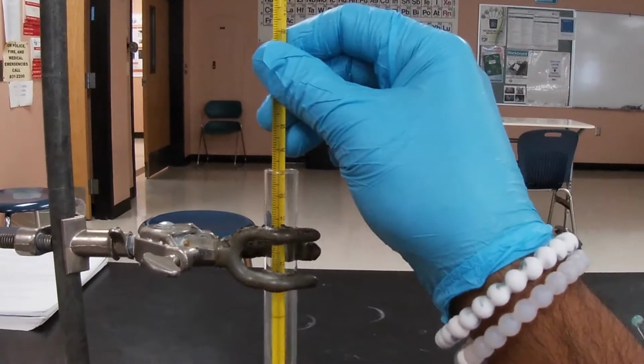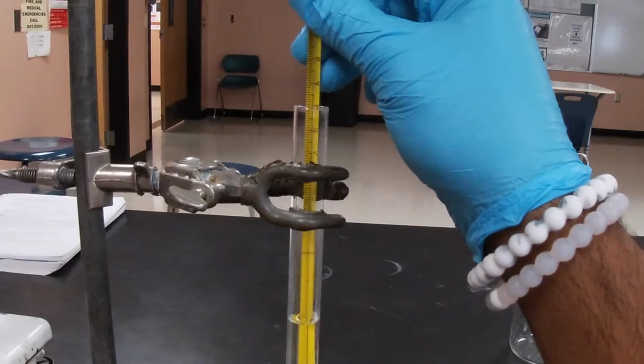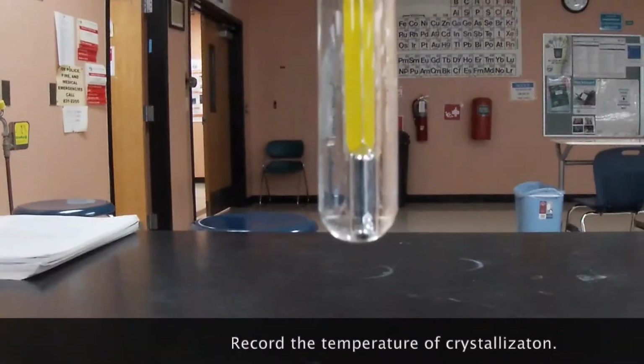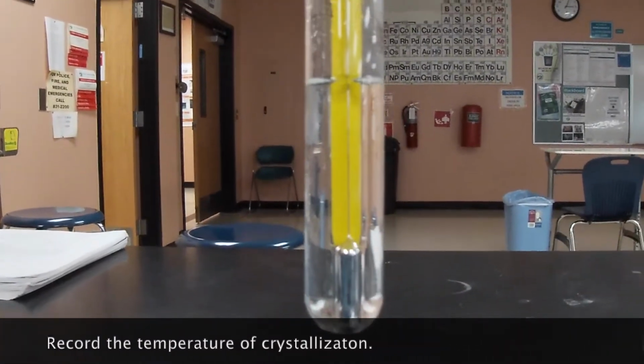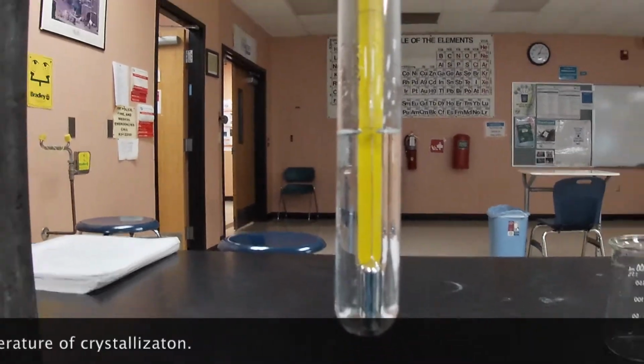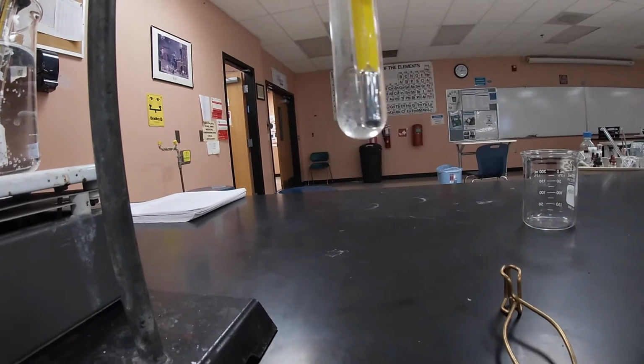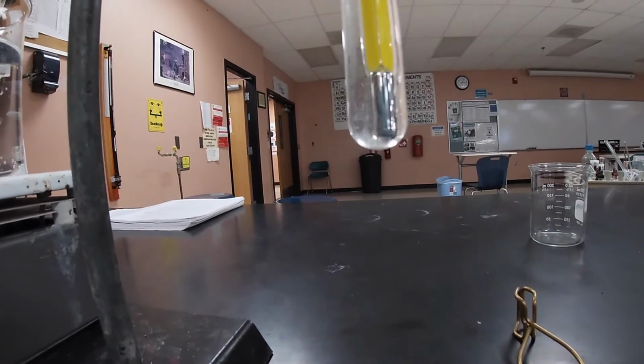And I'll continue stirring, and then I'll come back and let you know where we're at. Okay, so we started forming our crystals. Again, as I start stirring slowly, you'll notice some crystals picking up.